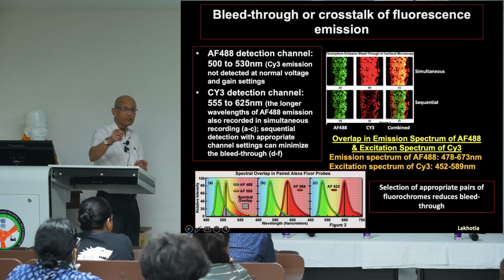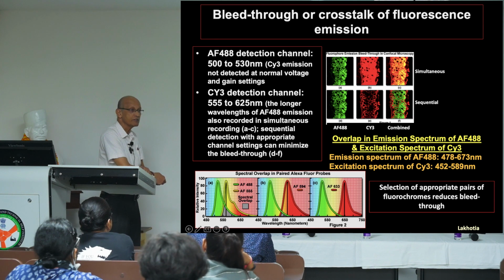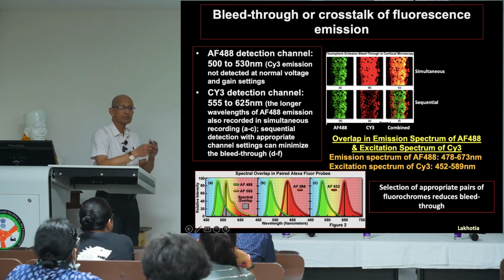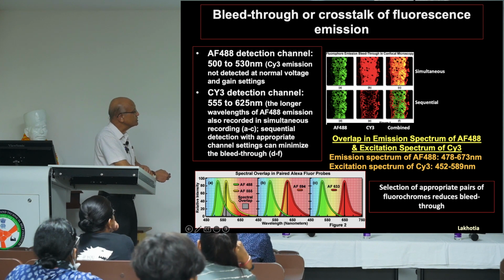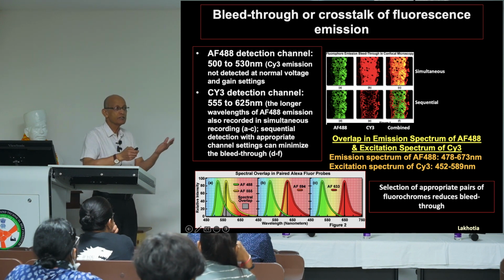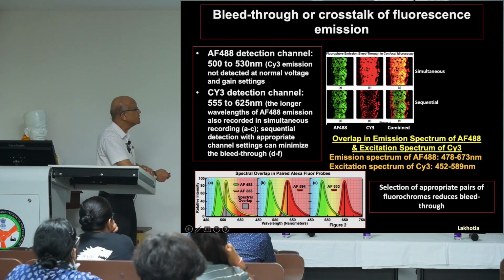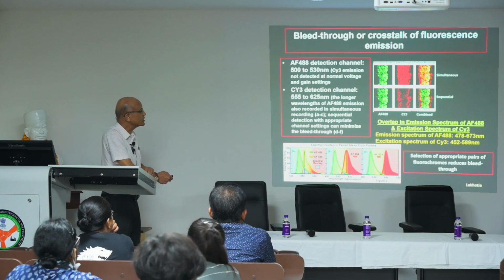But the light is coming out. In the same cell or same tissue, another fluorochrome, which needs 550 to this excitation wavelength. So what happens is this emission wavelength also excites this. And therefore, that's what we call bleed through. And this is what's happening here, that for example, one fluorochrome gives this image, but if we do simultaneous detection, that we excite both the fluorochromes, which is possible in confocal, that you can excite both the fluorochromes together and detect both of them in 2 PMTs. But then some of this excitation beam will excite the next fluorochrome also. And therefore, you get a combined image like this.